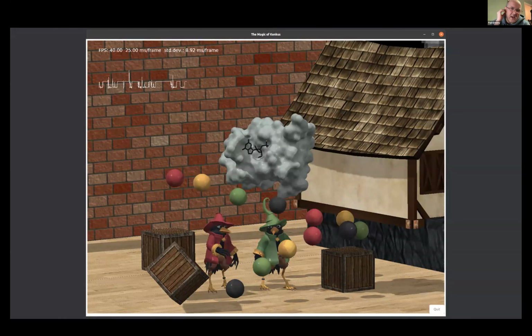So I was basing it off these models. I was basing my engine off of the models that I downloaded from the internet, these boxes. I wrote the engine by hand, but the models there I downloaded. Because they're simple, because they consist of only a few hundred vertices, it's very easy to start up the program and test it rather than looking at a whole protein. But ChimeraX allows one to generate surfaces and export them as GLTF, and that's what I did.